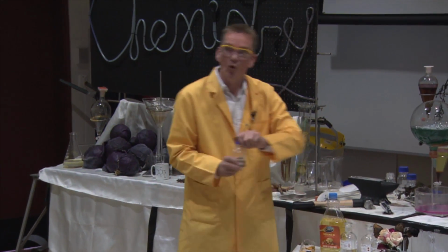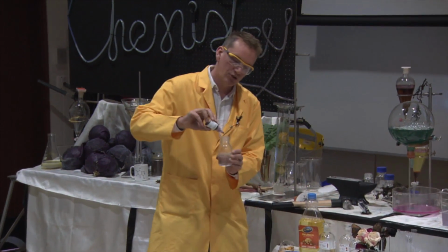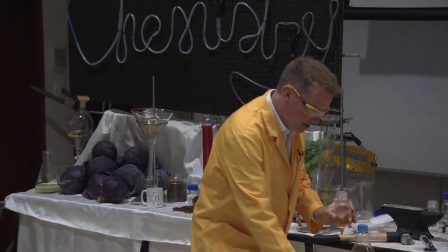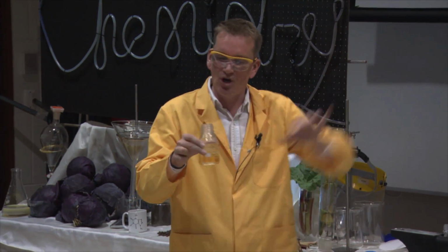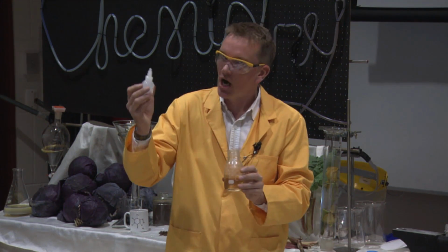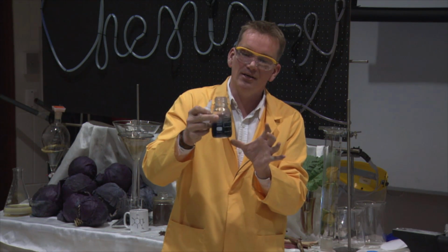But anyway, right now, what can we do with this? Well, I've got some water here. I'm going to add some of the iodine to the water. Now this one isn't purple, by the way, and that's because the iodine is interacting with the water in a different way. It's the free iodine molecules that have that nice purple colour. With some water here, it's a sort of browny colour. Now I'm going to add some starch, though. This is like from the potato, and we get that nice bluey black colour.